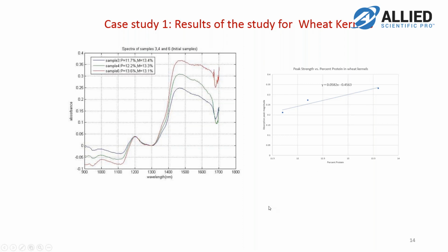The problem arises if the moisture contents are different, and we didn't get to testing this as far as different moisture contents are available, but the technique works when the moisture content is similar and only protein content is changing.